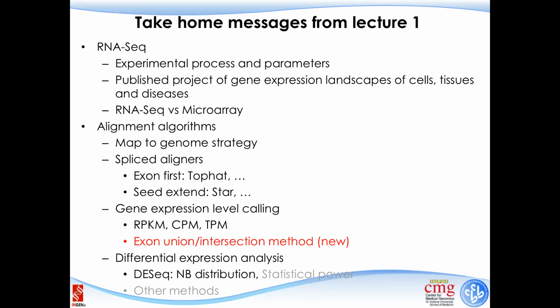And today I will also introduce something new, named the exon union or exon intersection method in assessing the gene expression level for each gene, considering possible alternative splicing isoforms. And then in the first lecture we have also talked about DE-Seq. And today I may use the hands-on part to introduce some details about DE-Seq. So no worries about this part now. I will introduce some details again later. So if you think, okay, some terms I don't know the meaning of, please concentrate in the next 20 minutes. I will introduce the key points of those methods again. And those may be related to the exam, 2 questions.